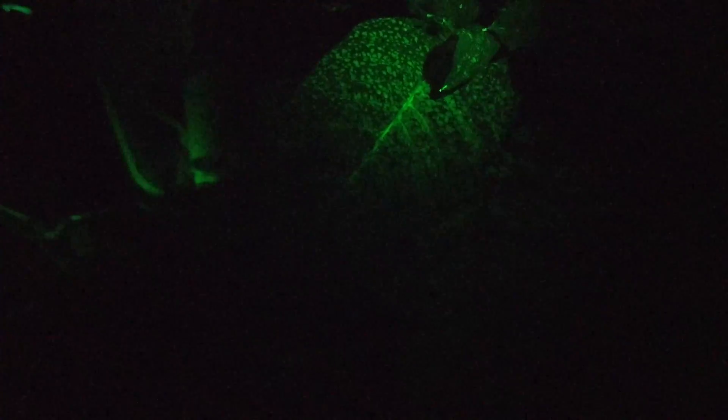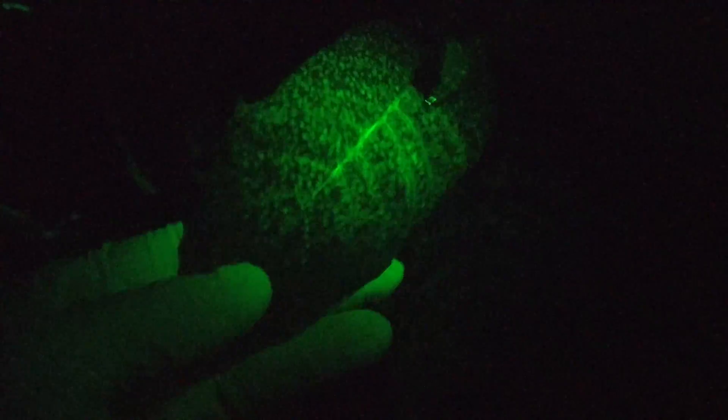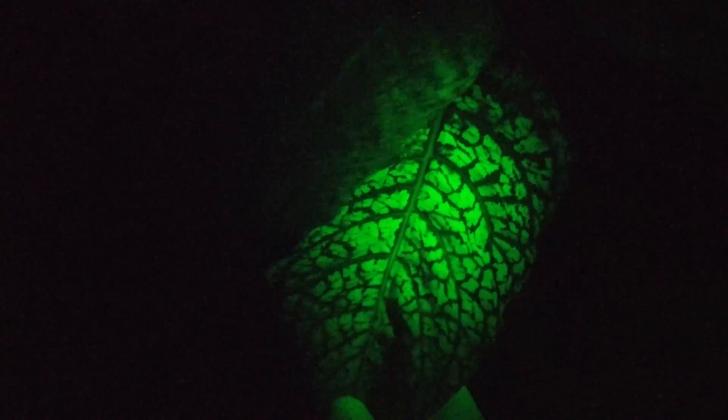Look at that. How cool is that? Look at this leaf. As you can see — glowy glow. No glowy glow. Yep, that is pretty cool.